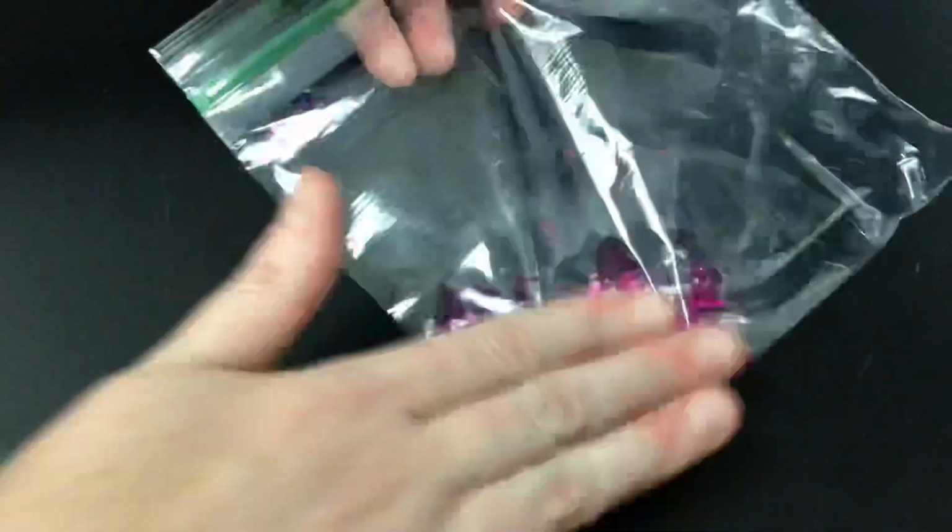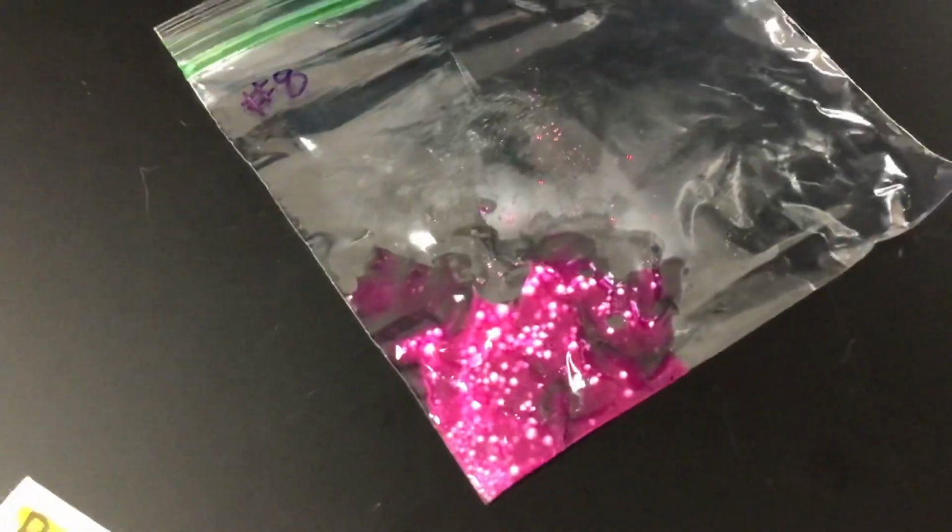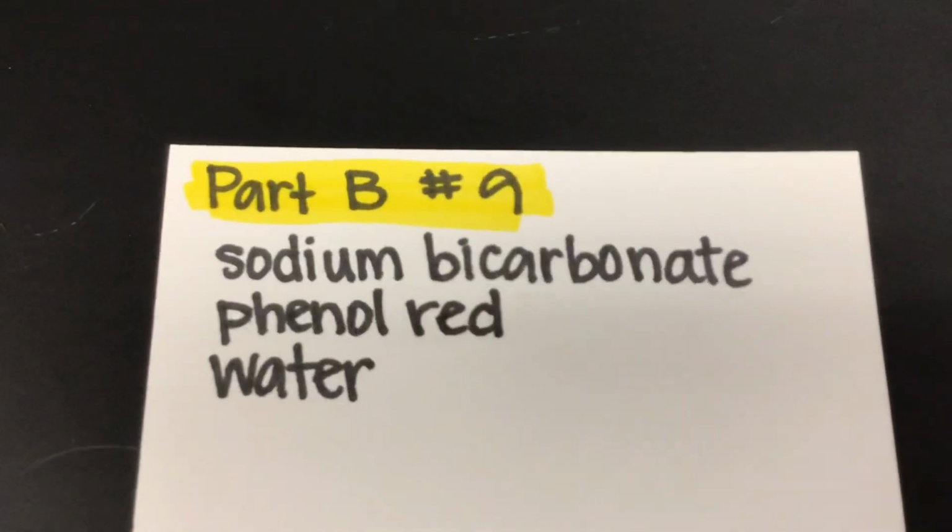Okay, it's quite warm. Very warm. You can actually see the steam forming on the bag on the inside. So there's some steam forming. Looks like the color maybe changed a little bit. Okay. And the last one, number 9, sodium bicarbonate, phenol red, and water.